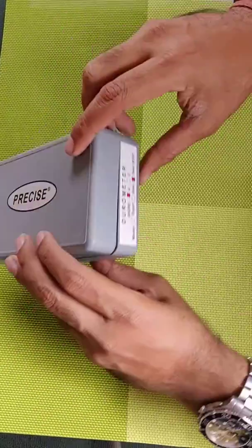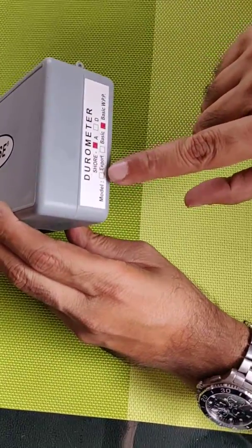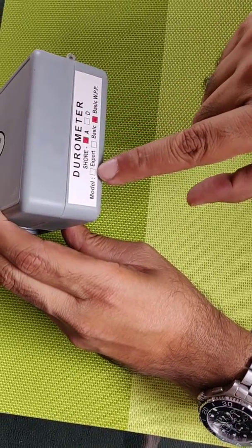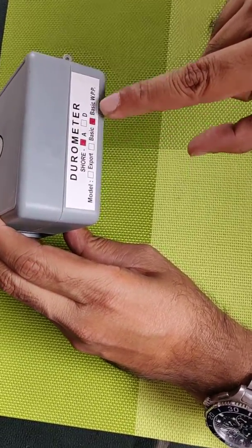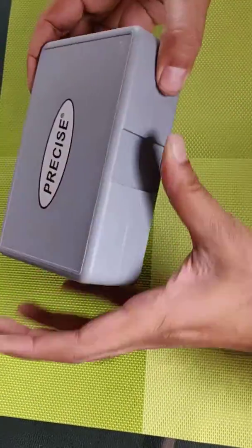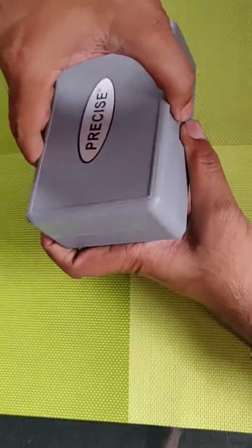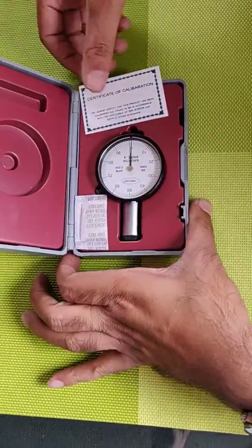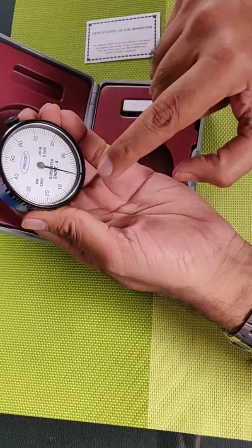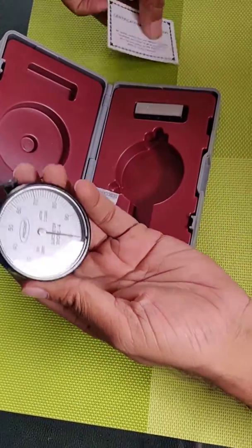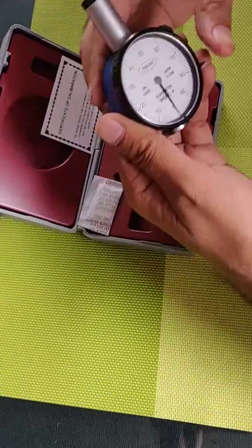Rubber hardness tester. There are three versions: Shore A, Shore D, export model, basic model, basic WPP. WPP means without the double needle. So this model is a basic model. It's a round body basic model and it has only one pointer. In the box you have a calibration report.